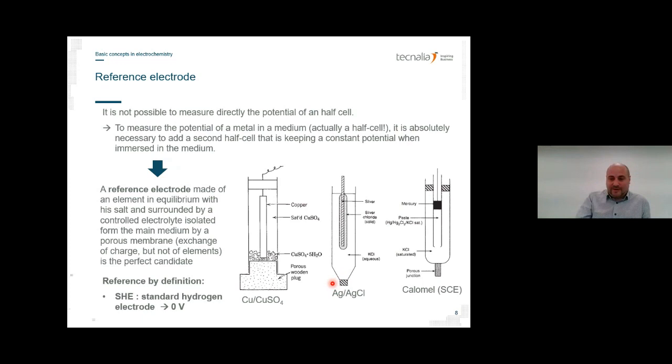Okay. So if you look, I can show you some reference electrodes. I have some with me. I hope you can see it well. This is a copper sulfate electrode. You can see it's quite massive. This kind of electrode is usually used to do measurements in the field. They are robust and very convenient to use.